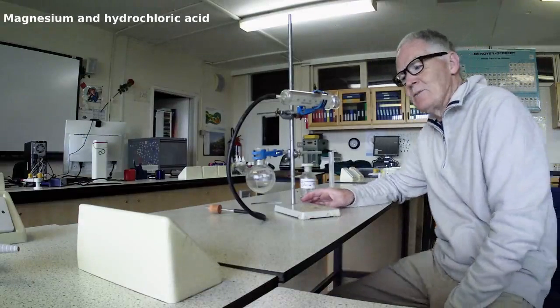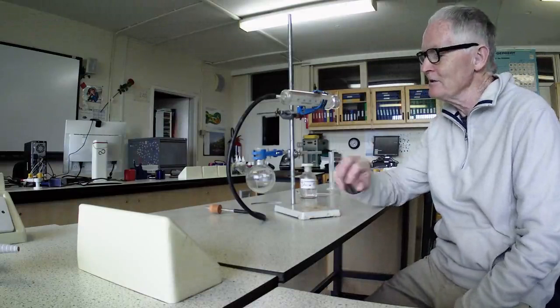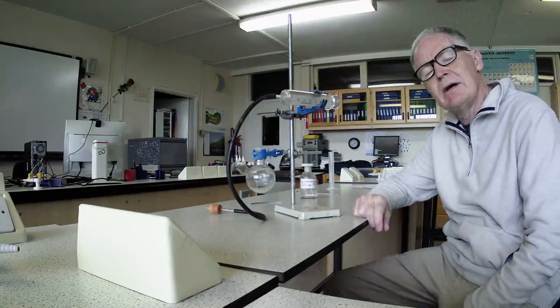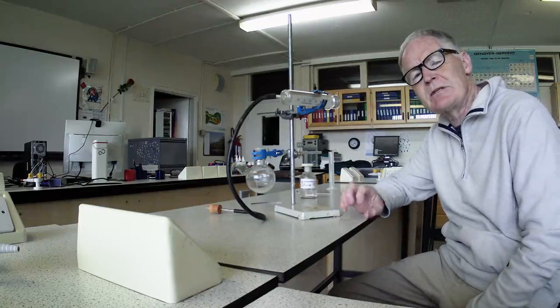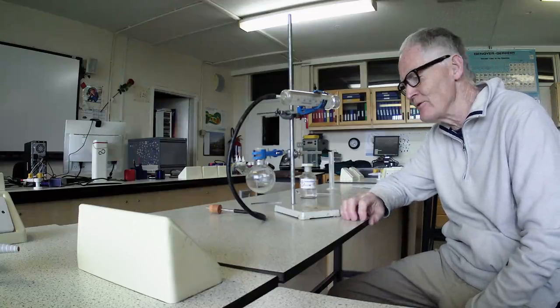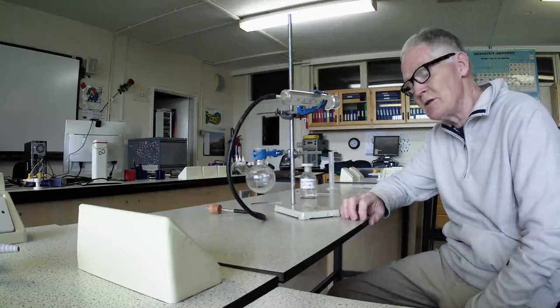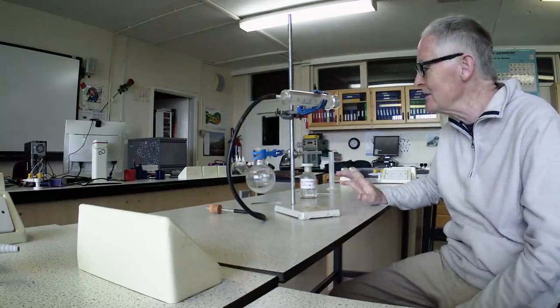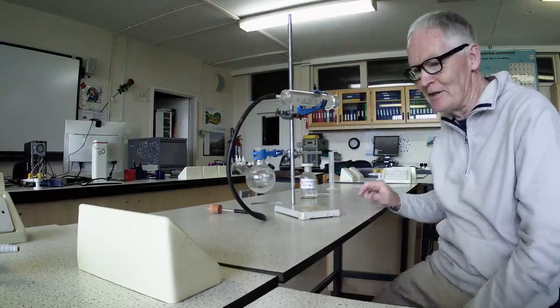Right, this experiment I have set up a gas syringe and a round bottom flask, and then we can connect them with a tube. And in this experiment we're going to use a state change to follow the course of the reaction. In the state changes there's going to be a gas given off and driven into that gas syringe. So I'm going to come round the bench to do that.